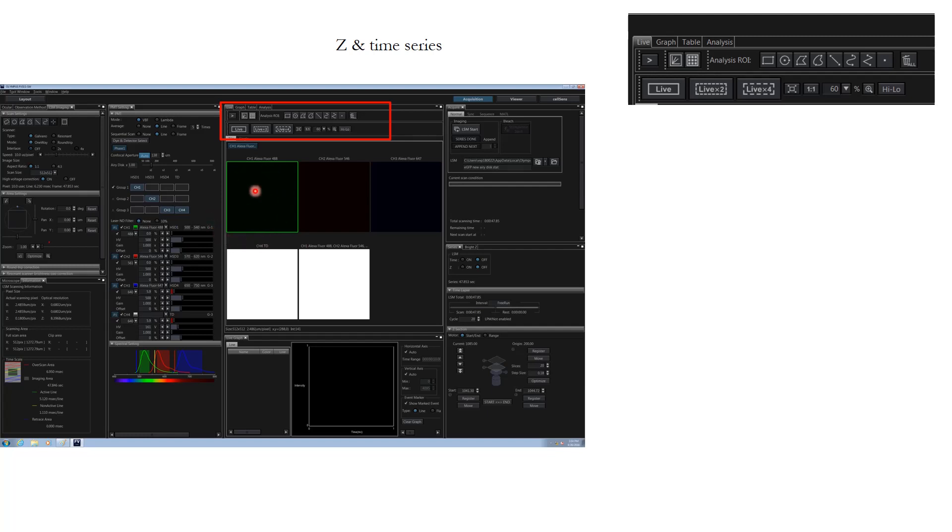On the other hand, you also do not want to have any saturated pixel in the image. What do I mean by saturation? Very simply put, when you wake up in the morning and you try to see out of the window the bright sunny light, because there's so much light you are not able to see the details, the trees and the cars. All you just see is bright white light.